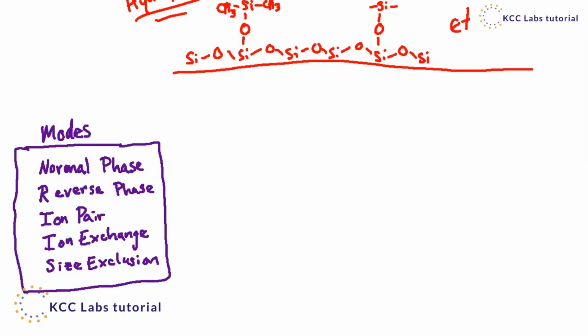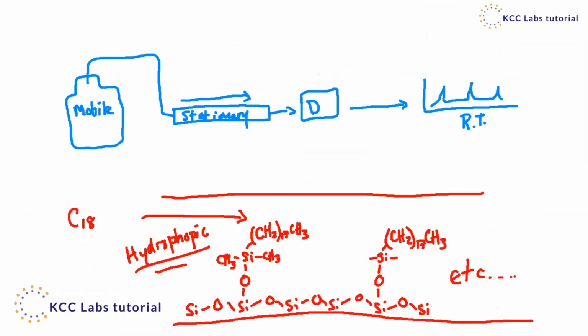So with that being said, I want to bring up an image here as we get ready to start wrapping up this first lecture and really go through each of the parts of an HPLC, because it's one thing to talk about it in theory with this sort of simple drawing I have up here in blue, but it's another thing when you actually walk into a lab and you see the HPLC. There's a lot of containers or boxes for this instrument that are sort of stacked on top of one another. So I made a rough sketch of an HPLC setup. It's very generalized, but it'll get the point across as we're talking about this. So let me bring that up and we'll take a look at that together.